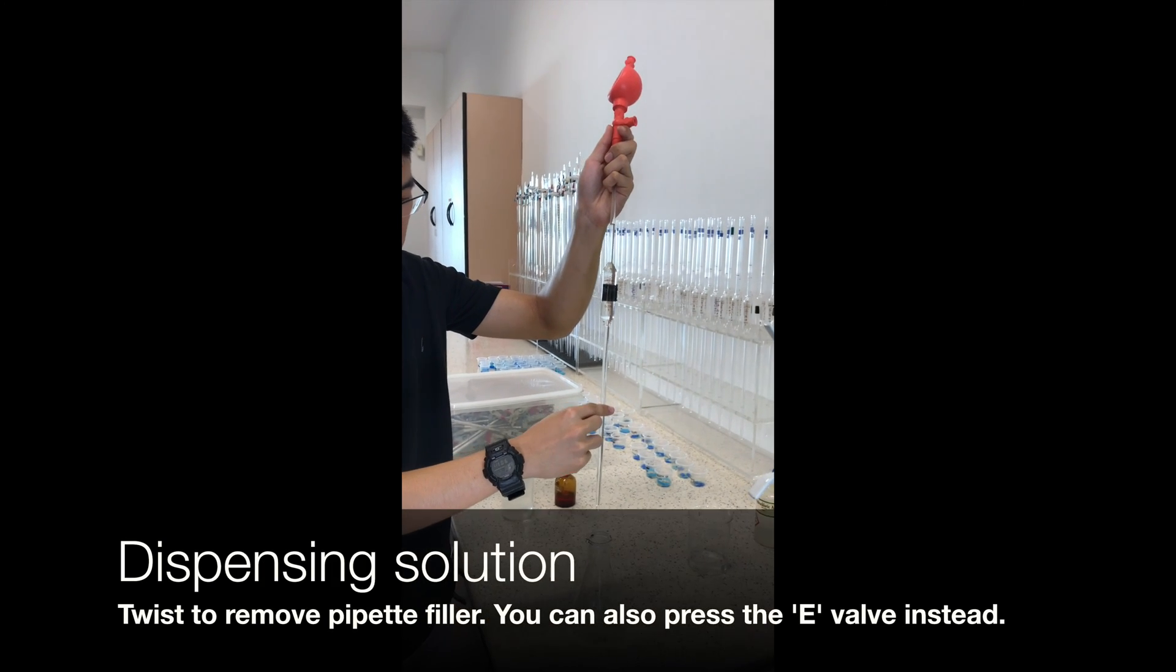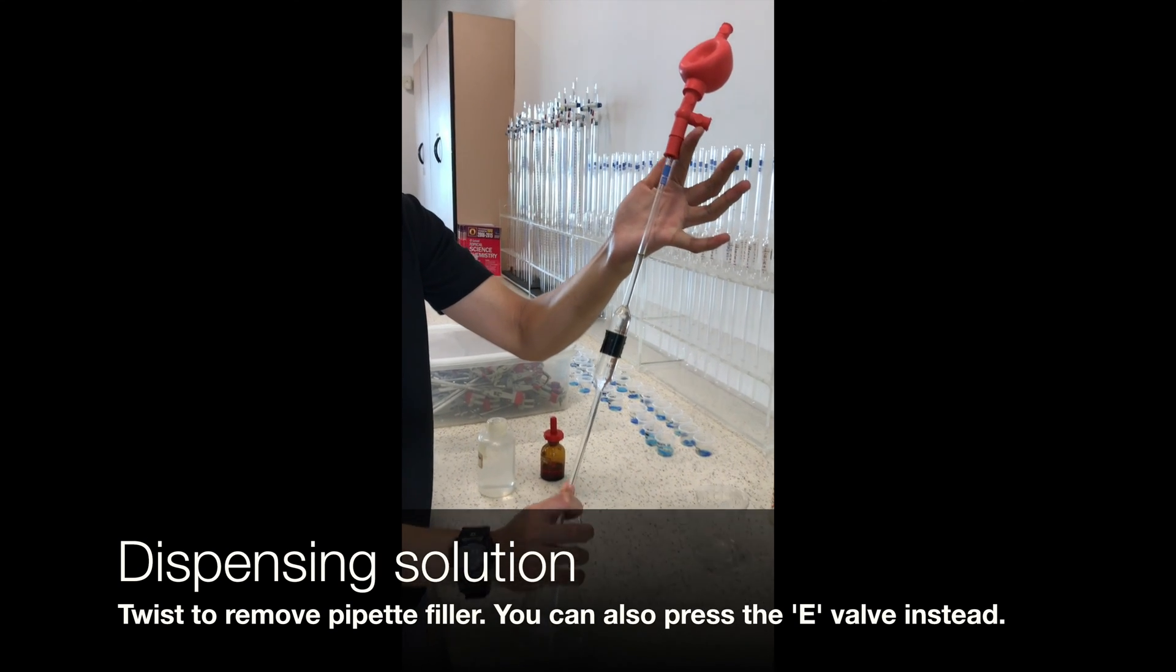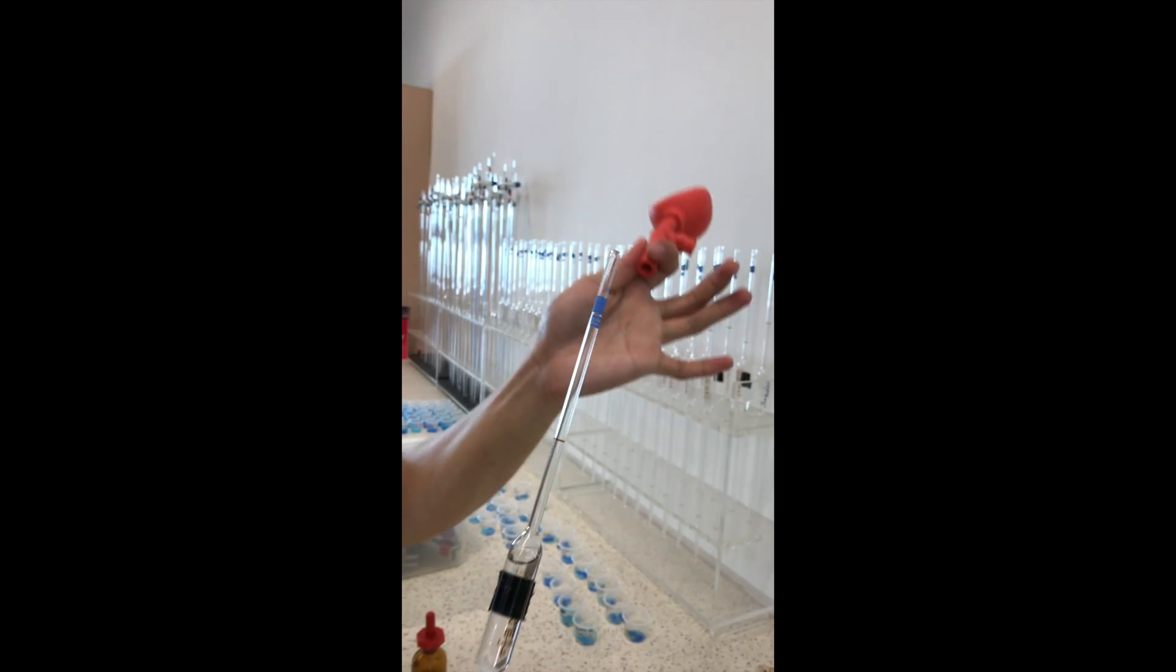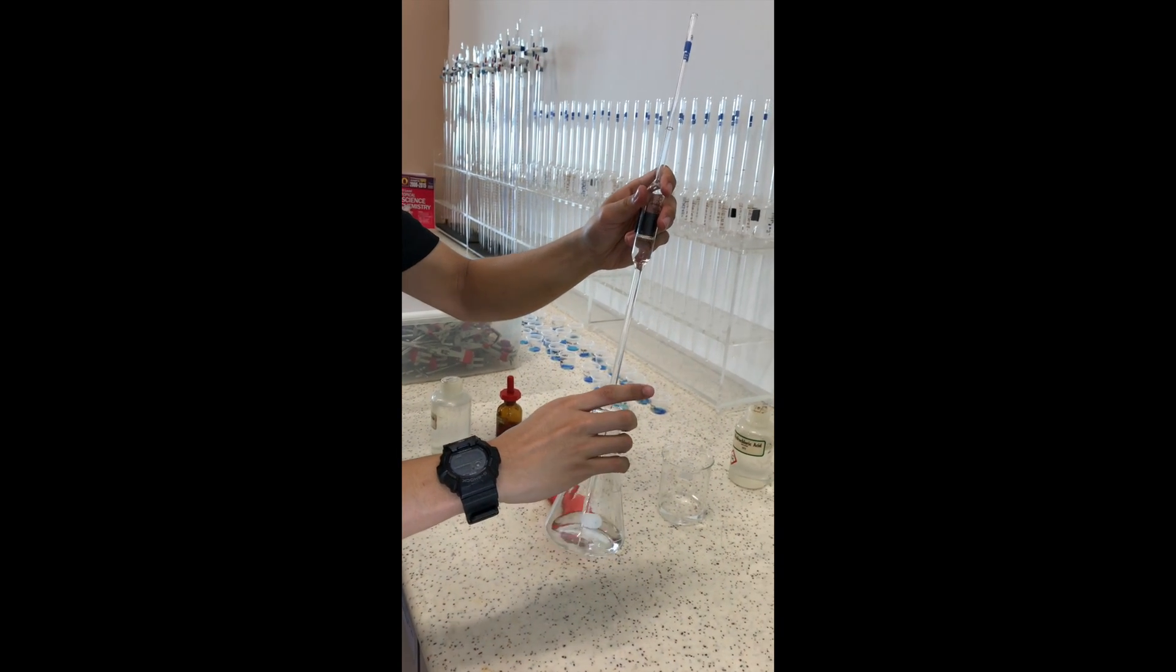To dispense the solution, we twist gently to release the pipette filler and slowly allow the liquid to drain into the conical flask.